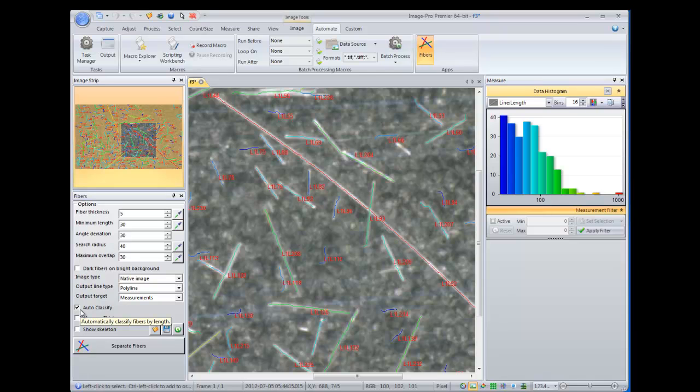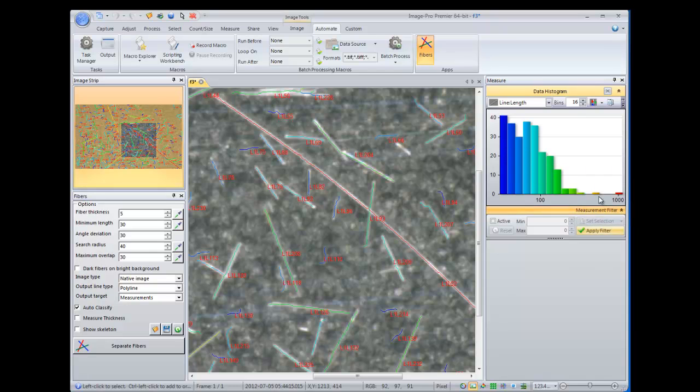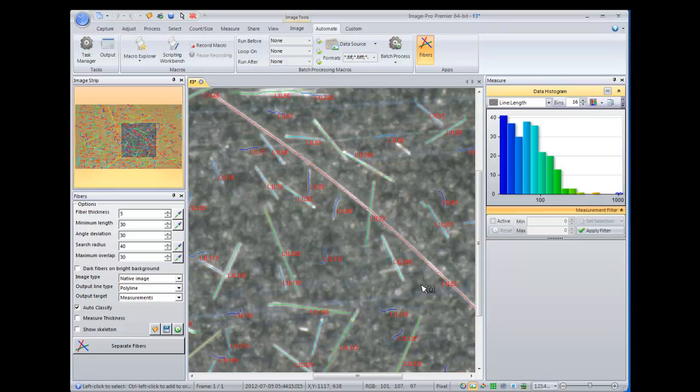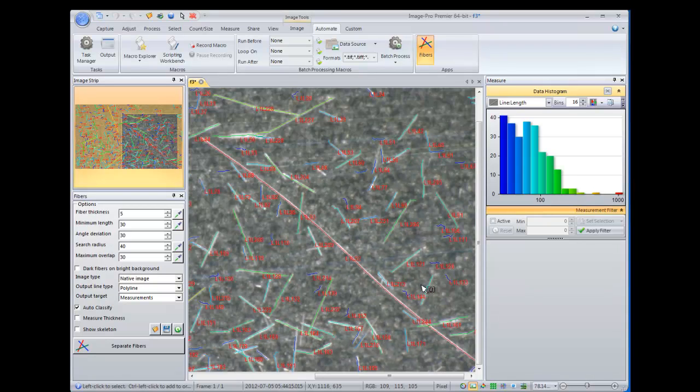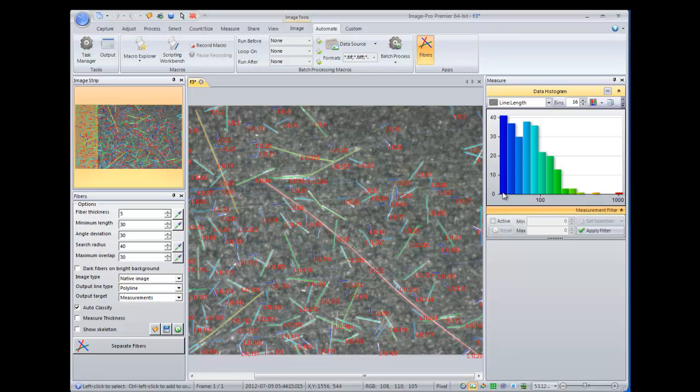And in our app, we had opted to automatically classify all of the fibers by length. So you can see that our data histogram is open on the right, and it is automatically showing the data histogram for the different lengths of the fibers. So in this case, we have one that's quite long, we can select it if we want to, and a number of other fibers, the majority of which fall into the much smaller length category.